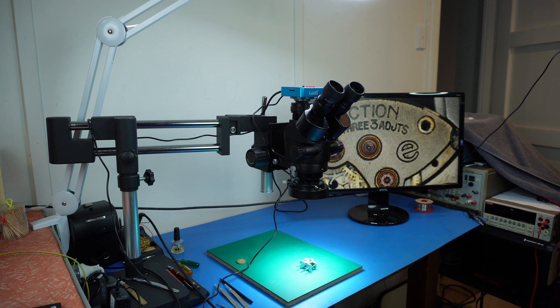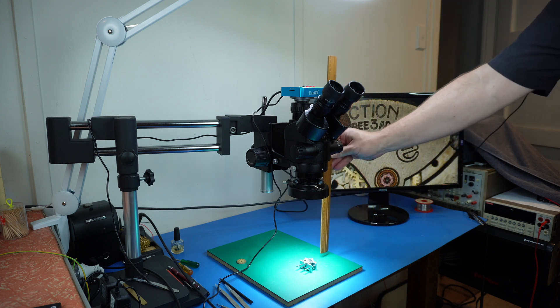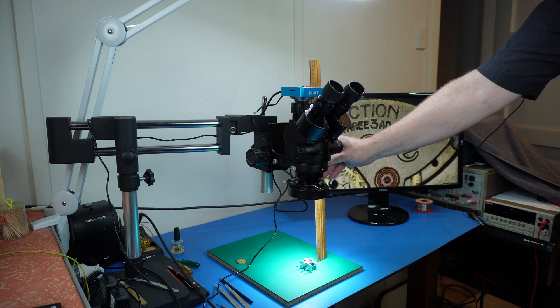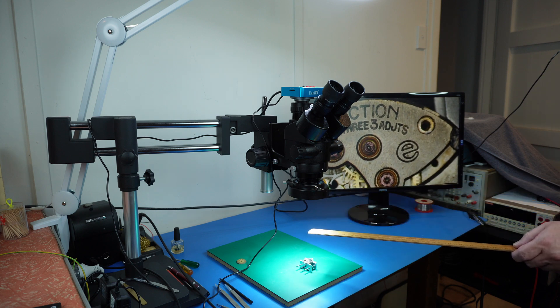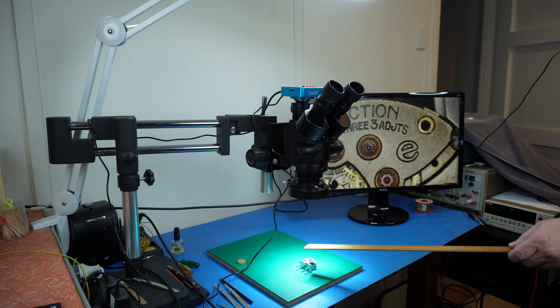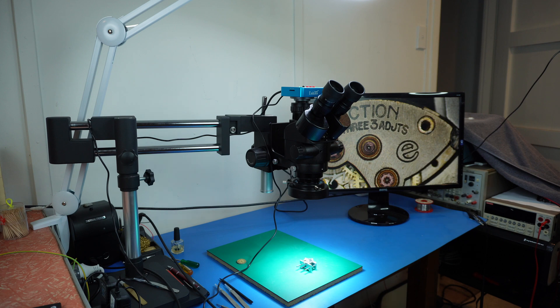Some of the things I really liked about this offering compared to what Amscope was offering is that you get some extra bits and pieces. You get two versions of eyepieces: a 10x and a 20x - I'm using the 10x. It also comes with a range of Barlow lenses. I've got a 0.5 Barlow lens on there, and the reason why that's really important for this kind of work is it gives me basically about 20 centimeters of space between my work surface and the lens. Without the 0.5 Barlow lens the lens would be down very close and there'd be a whole lot less room for working with screwdrivers, tweezers, or whatever you're trying to do under the microscope.